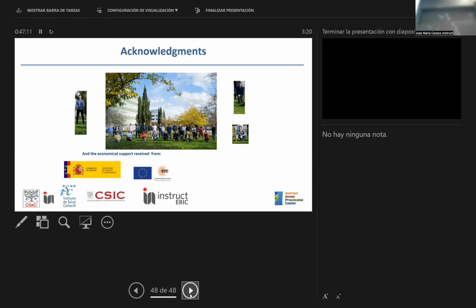Well, the first thing we do in our workflows is to make a consensus analysis of angular alignment. So when we process a data set in the CPM, we normally try to process it with Relion and CryoSPARC one or several times. And then we have the tools to tell you how many images are consistent between runs or between methods. And normally we keep those images that are consistent.